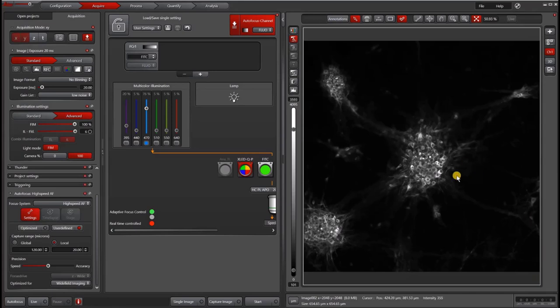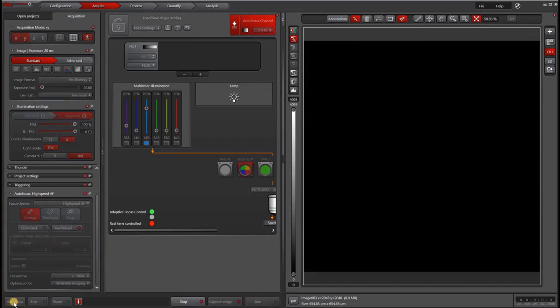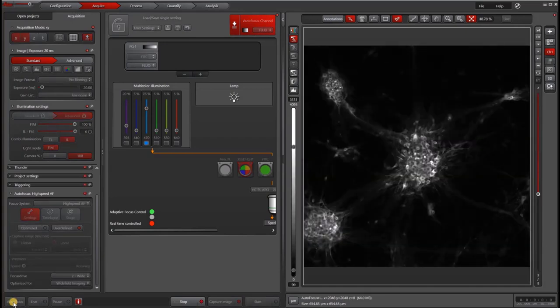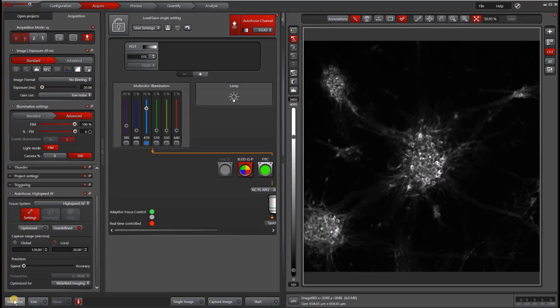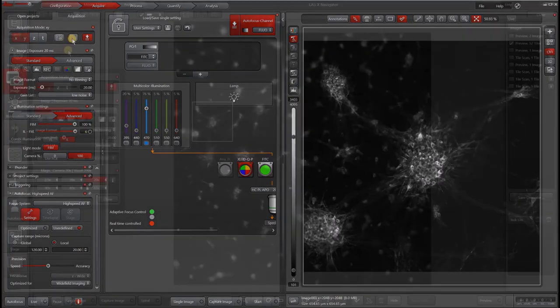Now it doesn't keep that Z stack. It only shows it to you temporarily. I'm going to go to high speed and let's do autofocus again. And there it only did eight Z stacks. But since I was pretty much within range, it did a pretty good job. But you do want to think about the fact that across your sample you might have a bigger variation than 20. So you could keep the speed at high, but also increase your local range such that you have a better chance of getting an in-focus image.